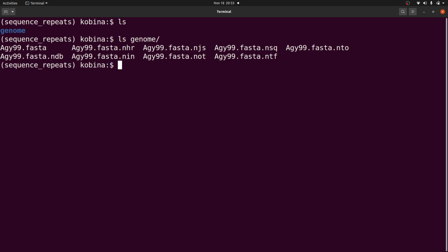So we are ready to go. We are going to call BLAST. We are running BLAST locally, so there's also an opportunity for me to show you how to run BLAST locally. If you want to do a BLAST search locally on your machine, you need to first have your BLAST database generated. You also need to have your sequence. And so we already have everything here.